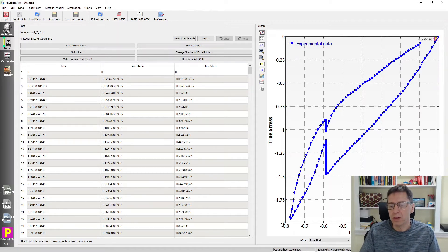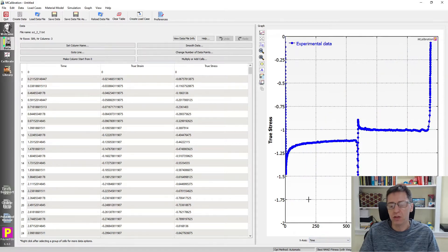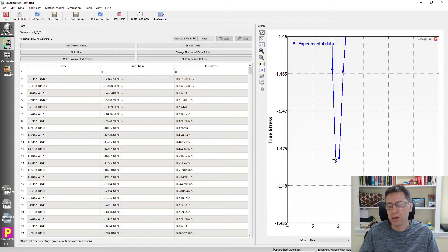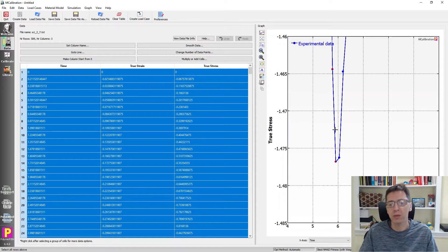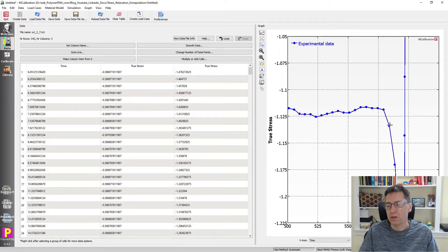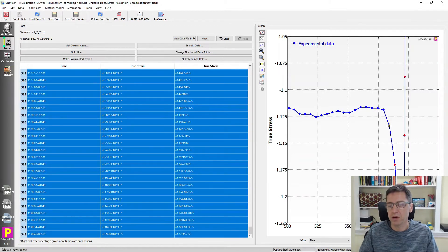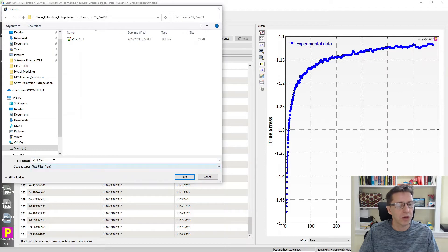I'm going to try to extrapolate what's going on in the relaxation regions. To do that, I'll zoom in and extract the data points individually. I'll change the graph to show time and stress — it's an easy way to figure out the start and end points of stress relaxation segments. I click on the first data point before the relaxation starts, then do Ctrl+Shift+Up Arrow to select all the points, and press Delete to remove them. I'll extract the data at the end of the relaxation segment too, then save this file to my hard drive.